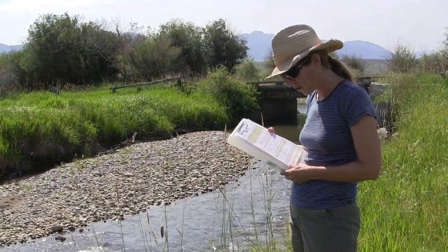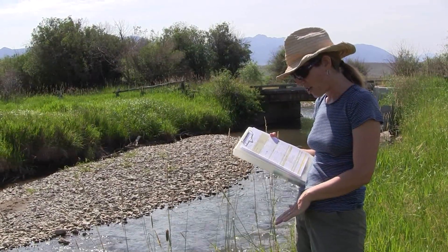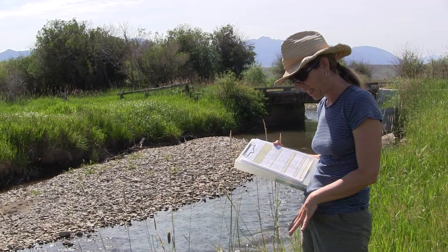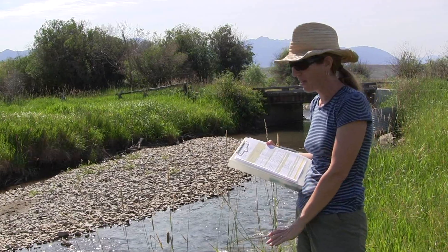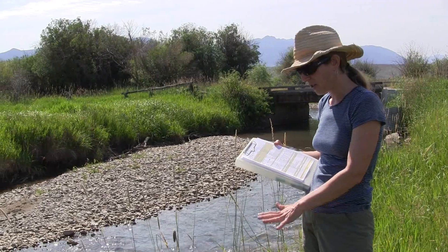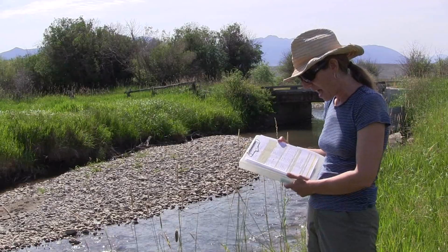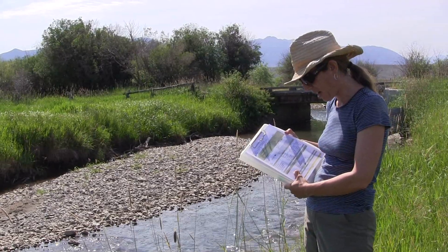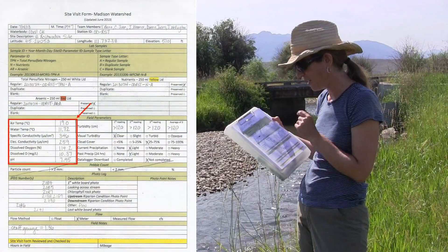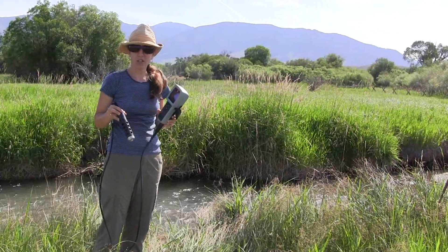Once you've given the probe a few minutes to equilibrate and it seems settled on the numbers, you can fill them in on your site visit form. It's best not to disturb the meter while taking readings, because jiggling the cord can sometimes change the readings it's getting. Try to leave it sitting still while writing down the numbers. The site visit form is set up so that you're more or less copying down the data in order down your data sheet.